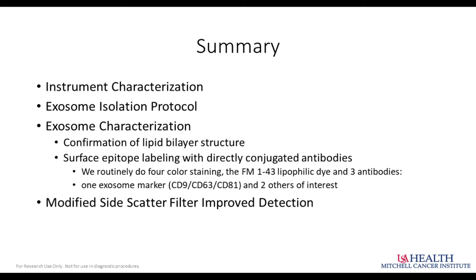This is not something, and I have to say this with the strongest emphasis, if you're thinking of starting working with exosomes, don't think you're just going to try it once and get some pretty data. We've been working on this for 2 years. This is not a trivial undertaking. You have to be very rigorous and methodical in the way you do things to really be able to prove to yourself and convince yourself that you are truly seeing the correct particle.